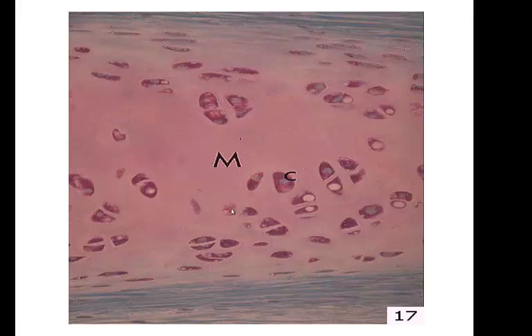Our first cartilage is hyaline cartilage. On the cartilages, the background is solid. So all of this background that you see here is a solid background. And what I look for are sets of owl eyes, like these things. This is actually a lacuna. This is a little cave that a chondrocyte lives in.